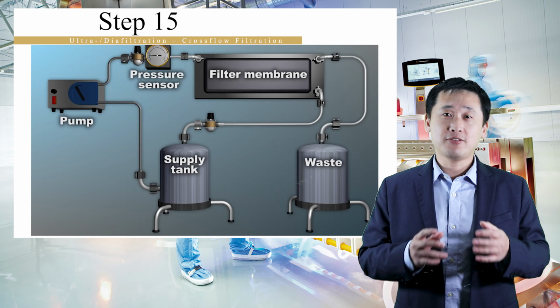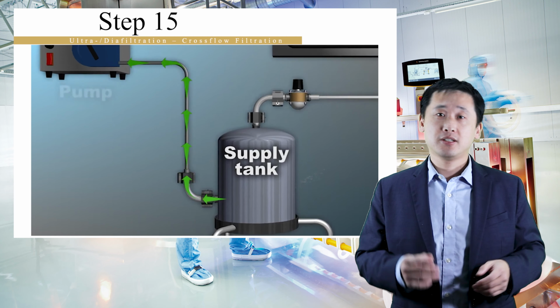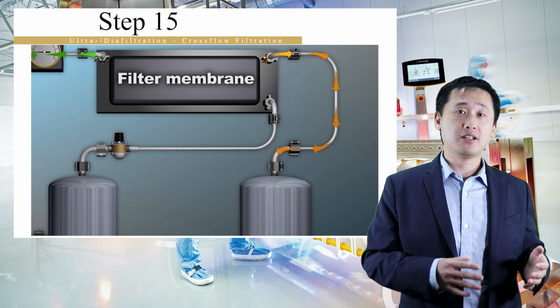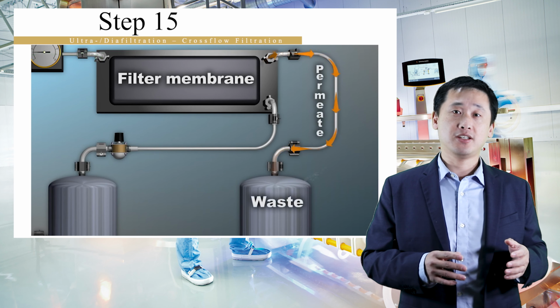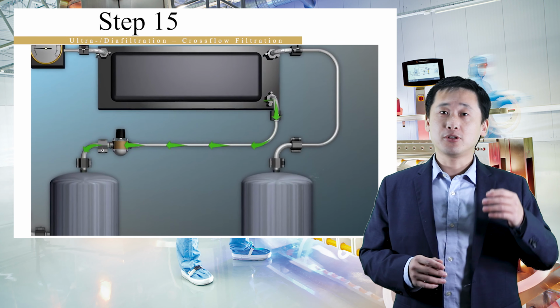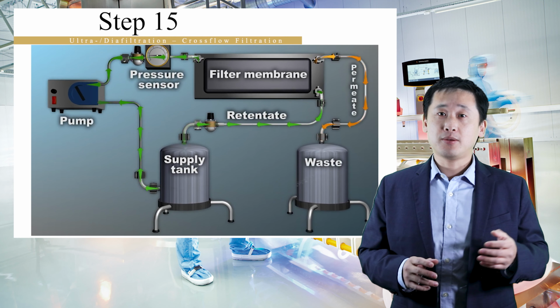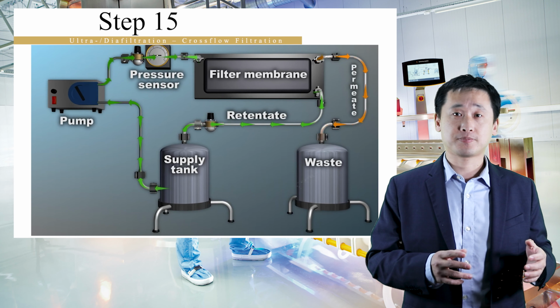Now, the permeate includes everything that passes through the filter, buffer included, and is sent to waste. Now, the retentate retains our targeted monoclonal antibodies and is recirculated back into the supply tank. And now, during this process, a new buffer solution is added to the feed. In effect, the product is washed with the new buffer solution, which helps remove unwanted salts while controlling the final concentration of the product. Again, this process and step can be achieved using the Sartorius Flexsafe cross-flow modular setup.